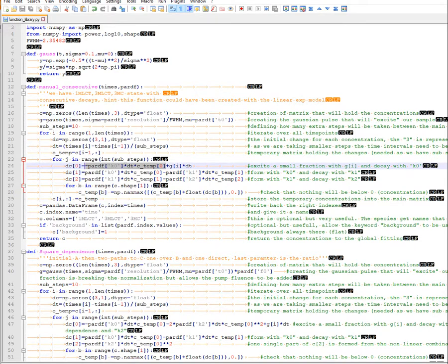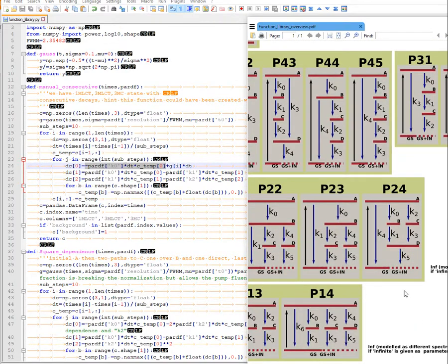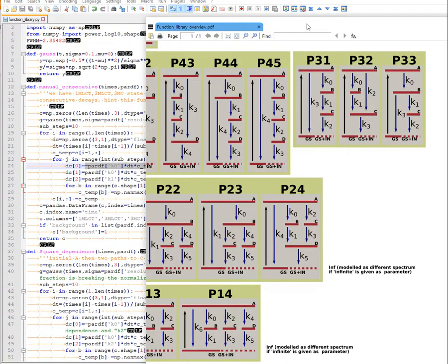In the example file, there are consecutive, there are square dependence, also a decay which is dependent on the intensity by a square factor, for example annihilation processes, and one distributed rate model where you have a central rate and you have a rate spread for describing the dynamics. In addition, there is a number of different processes or different model functions described, each one with a name.